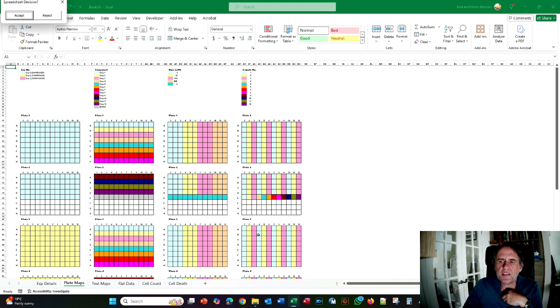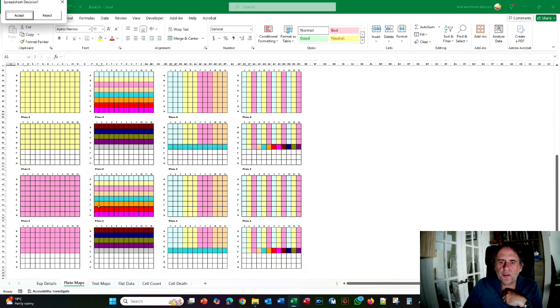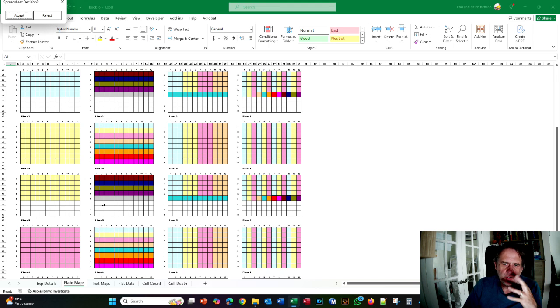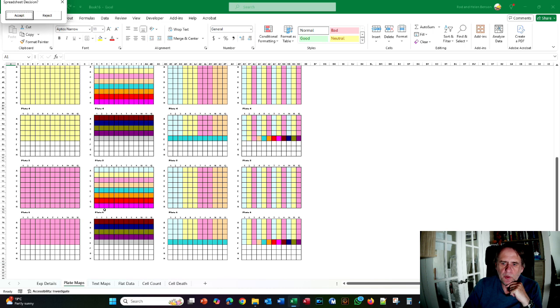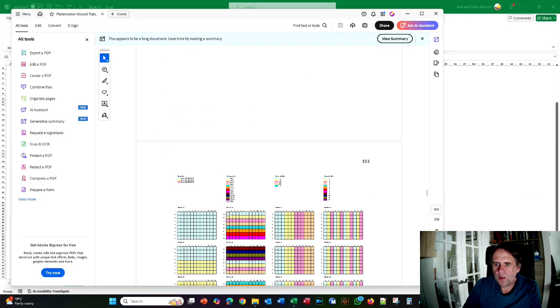So this is an interesting example where now you have controls on every second plate, not on every plate, because obviously in controls you can select to have it on every plate. This time it's still plating last, it's still plating only 1 plate only, but it does it relative to the experiment number, not to the whole group, as it were, and that's explained in this final section, which is here.